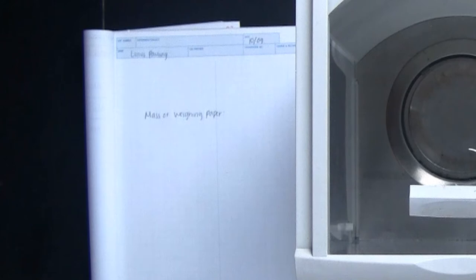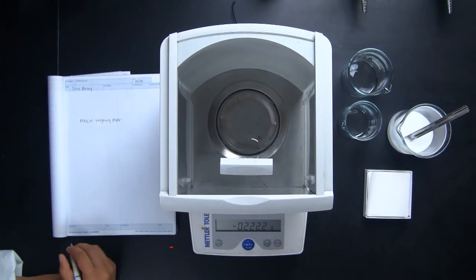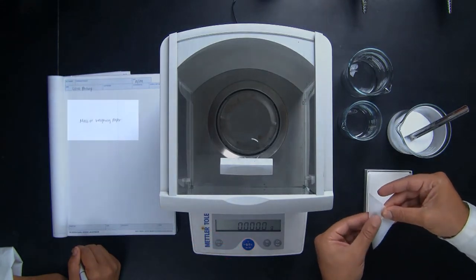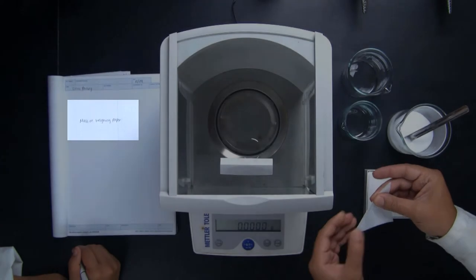Also, this time we're going to use the tare, or zero button, to zero out the mass of the weighing paper. So you will notice that in Wendy's laboratory notebook, there is no space for the mass of the weighing paper.